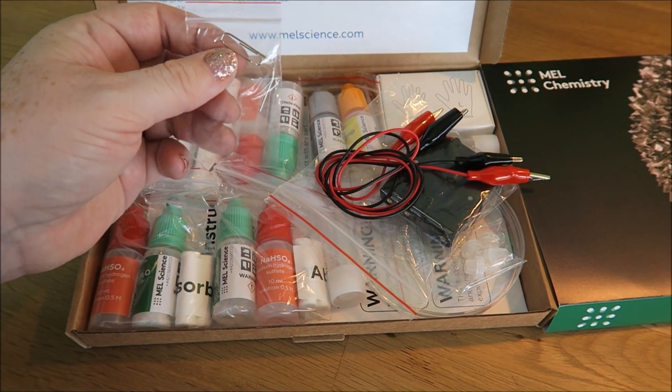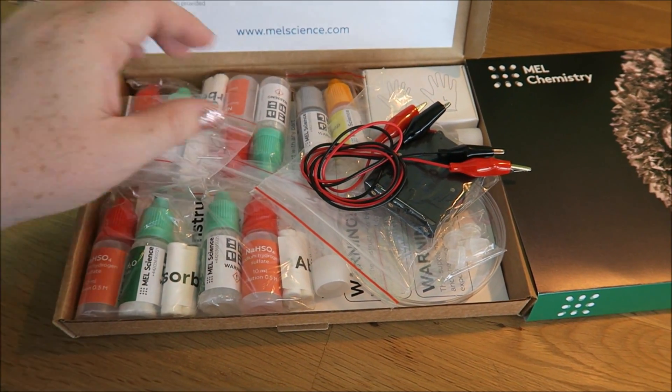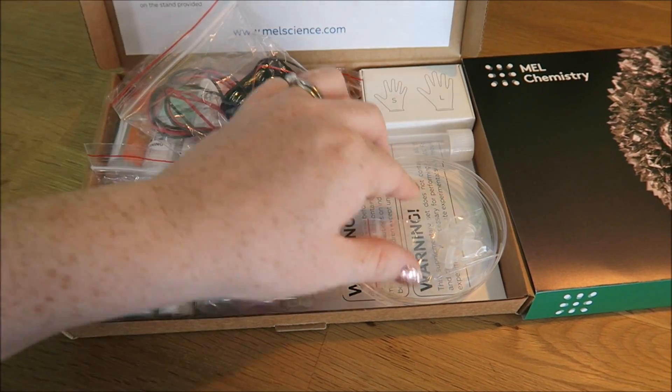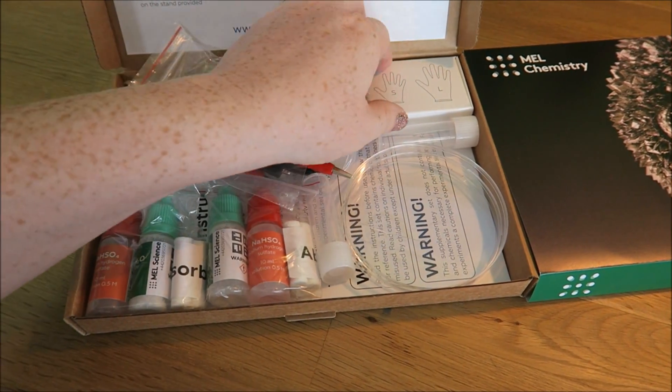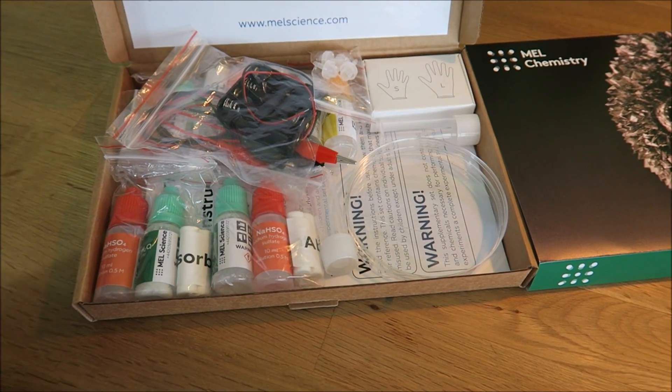Paper clips already opened up for you so you can open up the bottles. Little power pack, little petri dish for you to do the experiments in, and gloves in small and large.